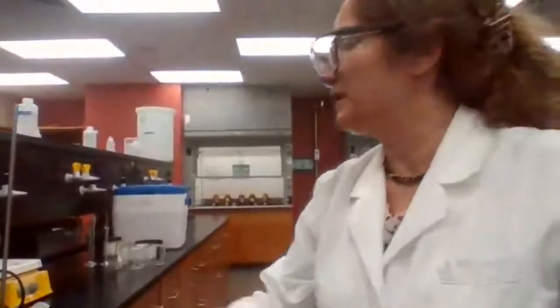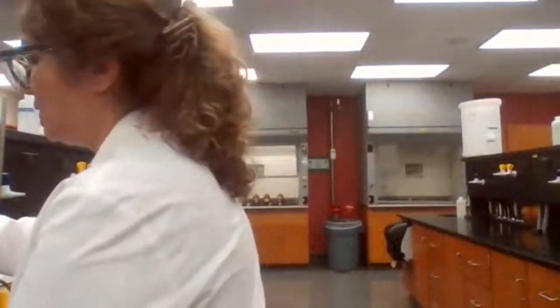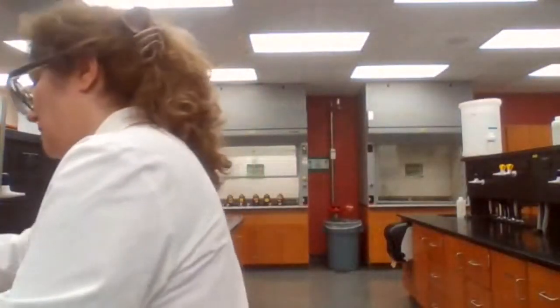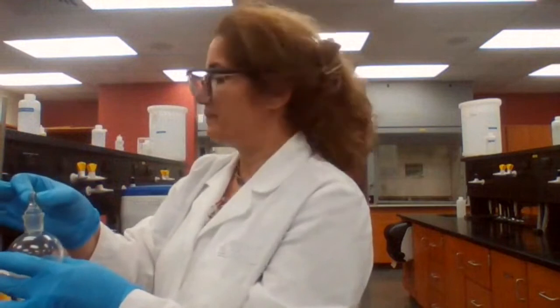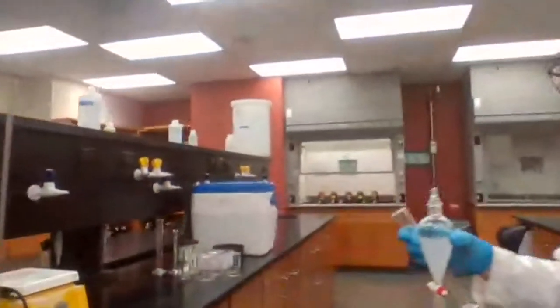So I'm going to have to take this to the fume hood because I don't want to bring the ether to the workstation. You're not here, but this actually smells nice for a change. A chemical that smells nice.